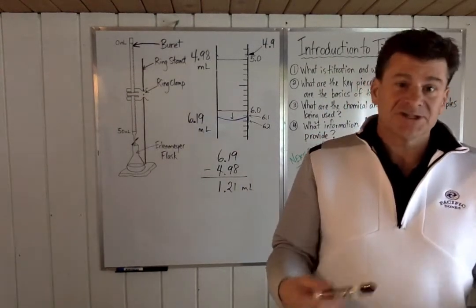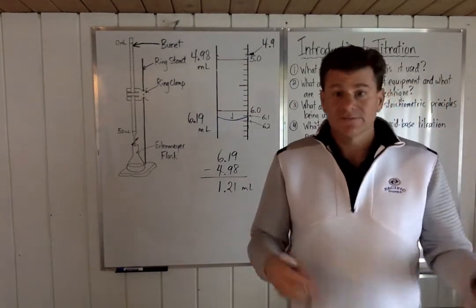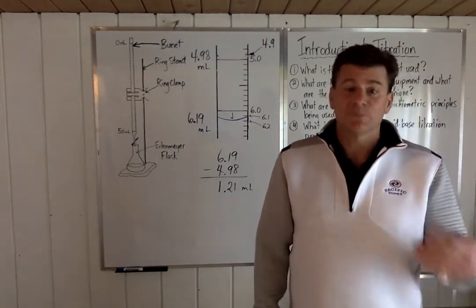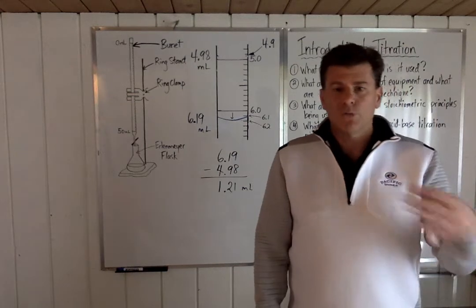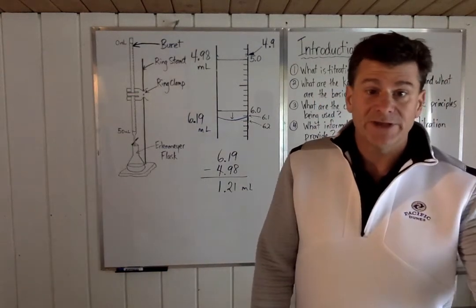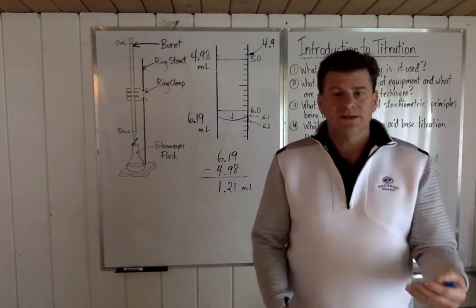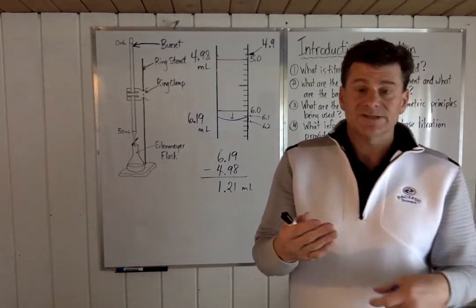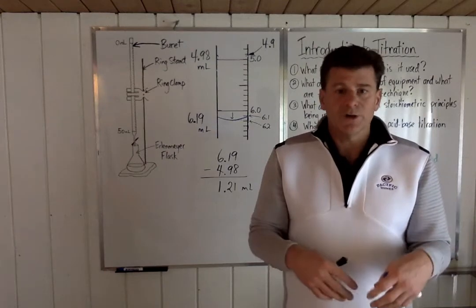Reading the burette is actually a critical skill. I know it sounds kind of, well, it's reading a burette. How challenging can that be? It's more challenging than you think. Now, the more you do, the better you get at it. And if you're constantly thinking, I've got to be at eye level, I've got to get in there close, and I've got to make sure I have the uncertain digit, you'll get good at it pretty quickly.